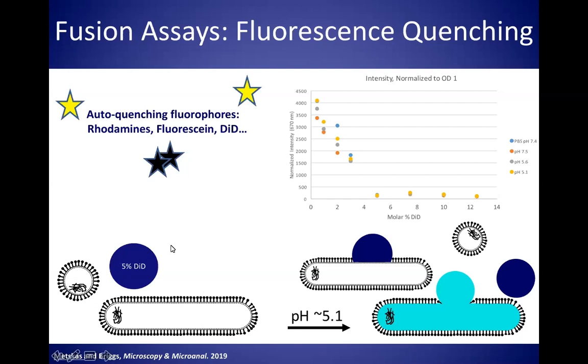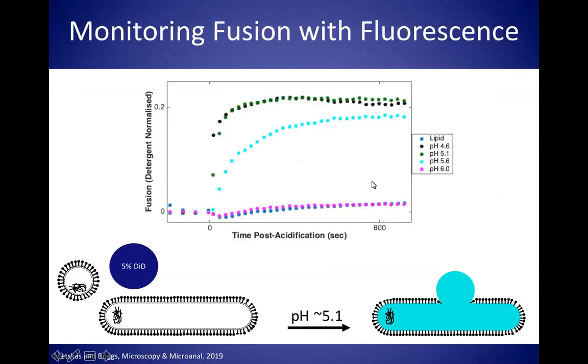And so if I mix this, I put a lot of fluorophore into a lipid vesicle. I add it to influenza, stimulate fusion with the pH, and I will get a slew of things, some non-productive intermediates, some things that never interact. But if I do get fusion, this fluorophore becomes diluted into the viral membrane, and so it becomes brighter. And so we get this burst of fluorescence moving from the onset of fusion through pH drop upward.